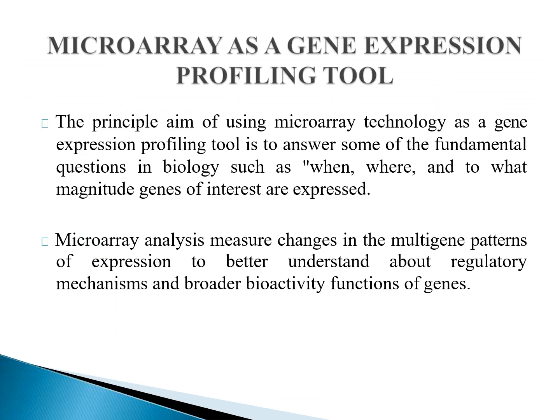Now, the principal aim of using microarray technology as a gene expression profiling tool is to answer some fundamental questions in biology, such as when, where, and to what magnitude genes of interest are expressed. So, as I have already told you, DNA microarray technology can be used for the study of the transcriptome. Suppose you have two different sets of samples and you want to see how the gene expression pattern is changing: when a particular gene is expressed, in which conditions it is expressed, and up to what magnitude it is expressed. In order to analyze all these things, we can use DNA microarray technology.